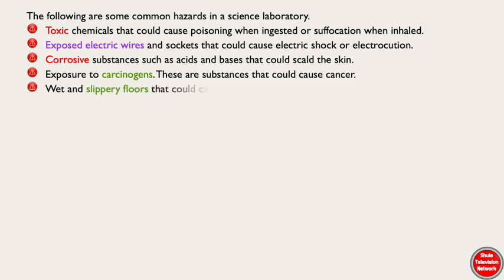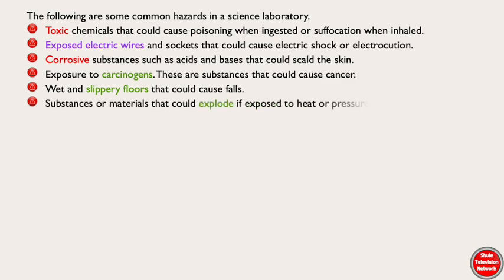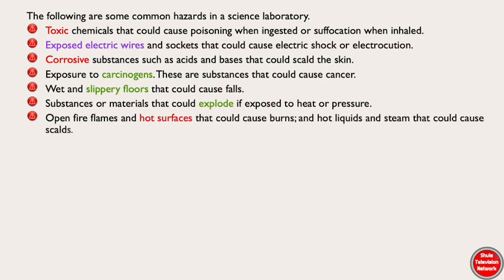Wet and slippery floors that could cause falls. Substances or materials that could explode if exposed to heat or pressure. Open fire flames and hot surfaces that could cause burns, and hot liquids and steam that could cause scalds. Flammable substances that catch fire easily and cause fire accidents.